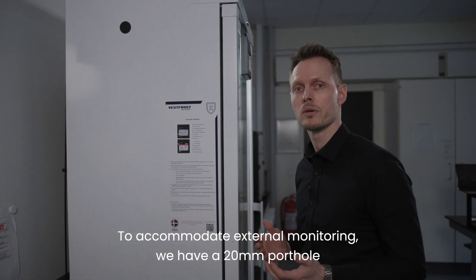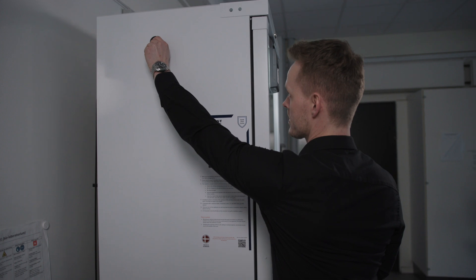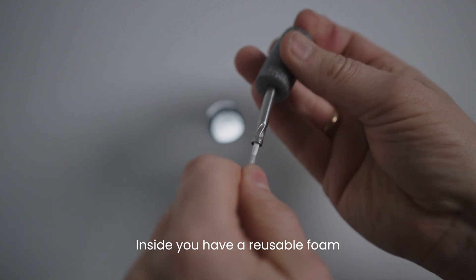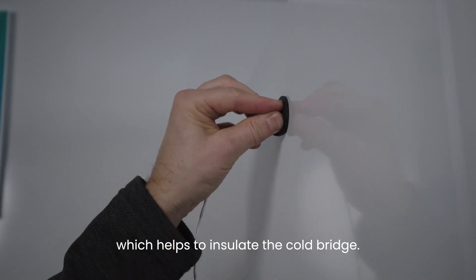To accommodate external monitoring, we have a 20 millimeter port hole on the side of the appliance. Inside, you have a reusable foam which helps to insulate the cold bridge.